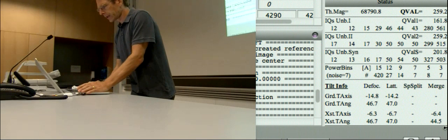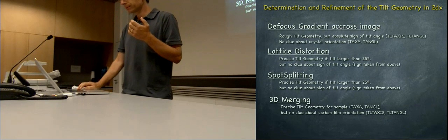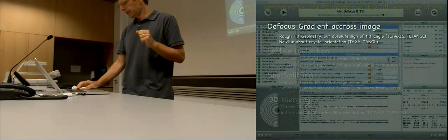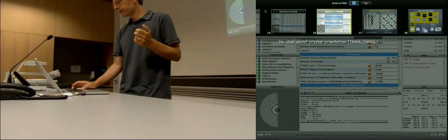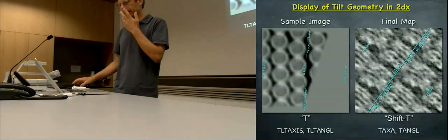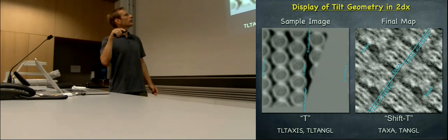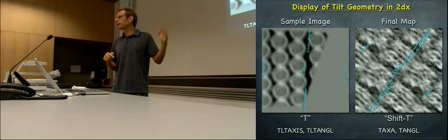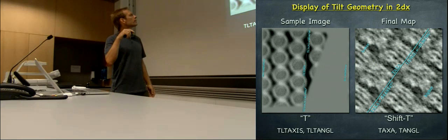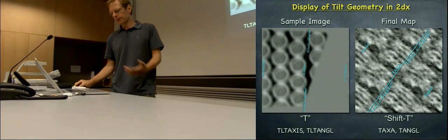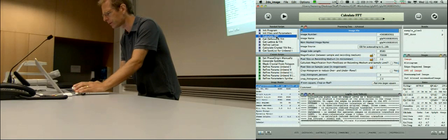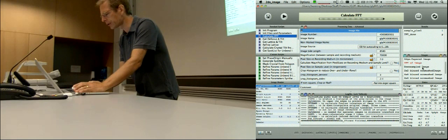So this is the definition of the tilt geometry. In 2DX we have two functions to look at tilt geometry. One is if you look at your raw picture — with spot scanning, with masking — you can still see where there is less underfocus and where there is more underfocus, and where your tilt axis and tilt angle are. You get this with the button T. So if I have a picture and go to the downsampled image and press T, then it says: less underfocus, more underfocus, and the tilt axis is here — minus 14 degrees. And the tilt angle is plus 46 degrees.